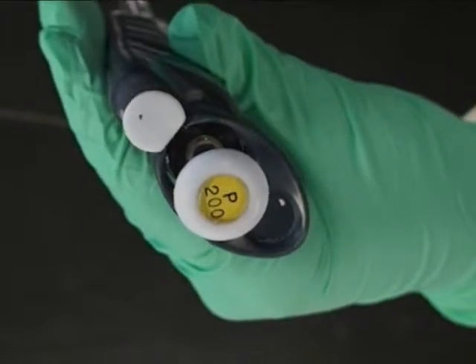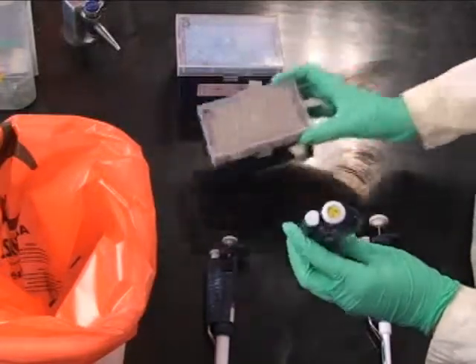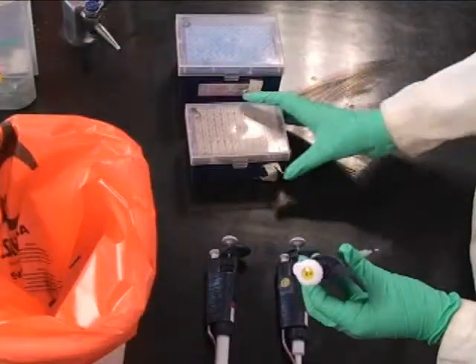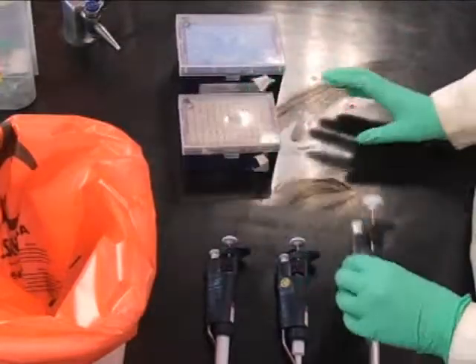A P200 pipettes from 20 to 200 microliters and uses the small tips. A P20 pipettes from 2 to 20 microliters and also uses the small tips.